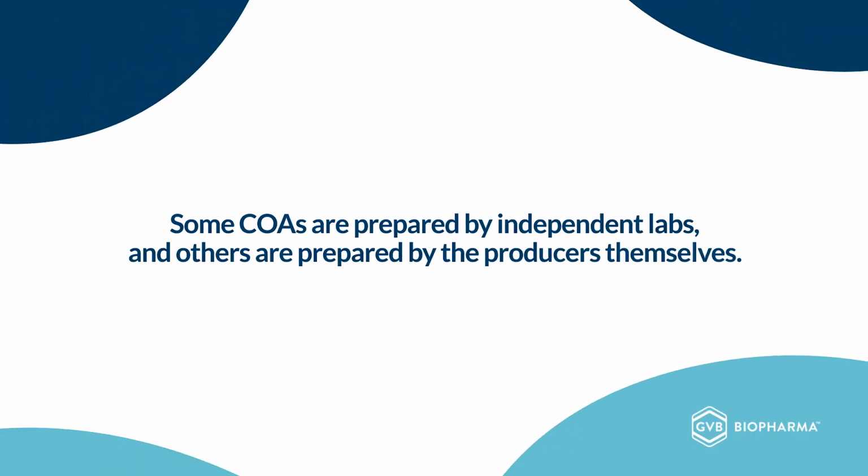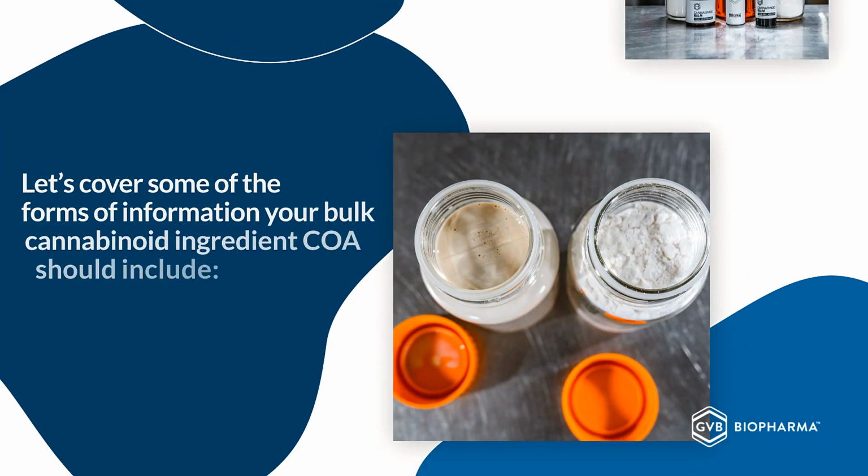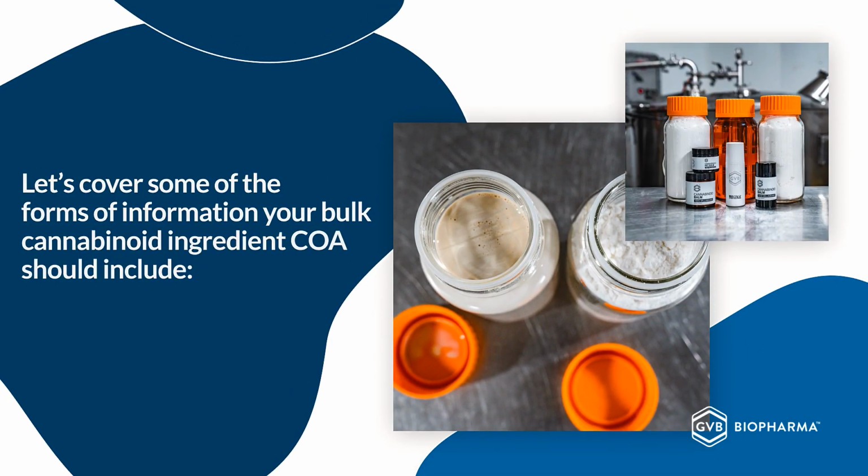Some COAs are prepared by independent labs, and others are prepared by the producers themselves. Bulk cannabinoid ingredient COAs provide information on, at the very least, the type of sample tested, and the sample's cannabinoid profile. Let's cover some of the forms of information your bulk cannabinoid COA should include.